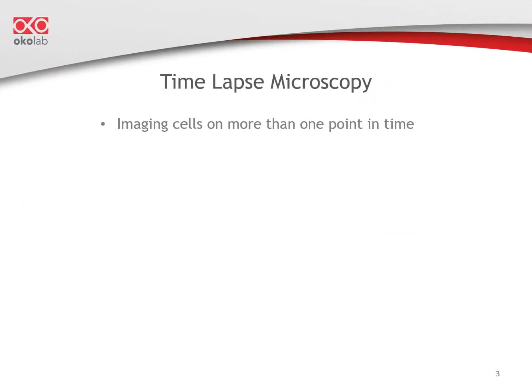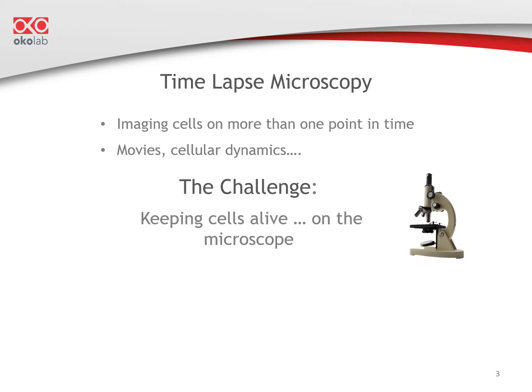Time-lapse microscopy involves imaging cells at more than one point in time. You may need to study cellular processes that occur over hours or several days. To keep cells alive while on the microscope, you have to control temperature, gas concentration, and humidity.